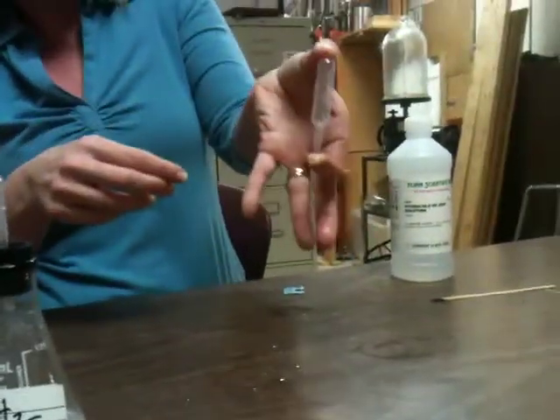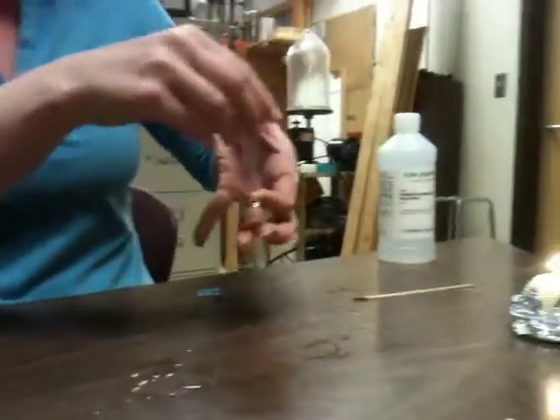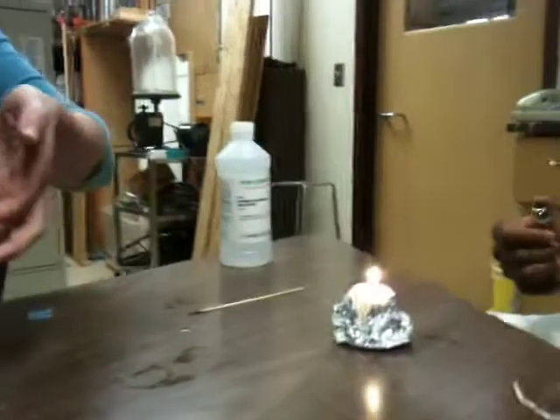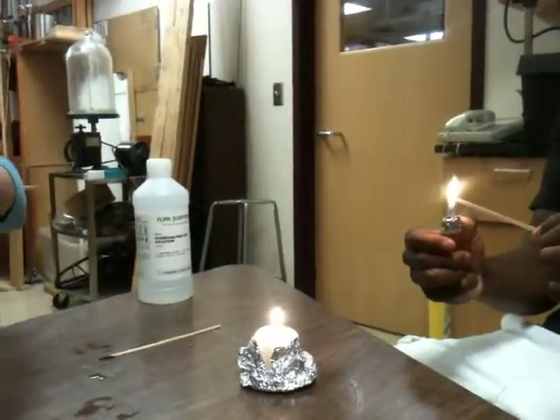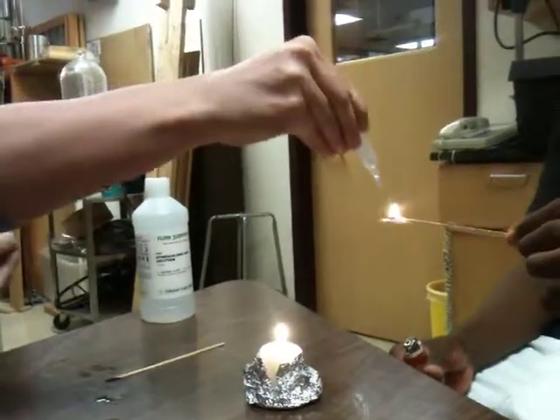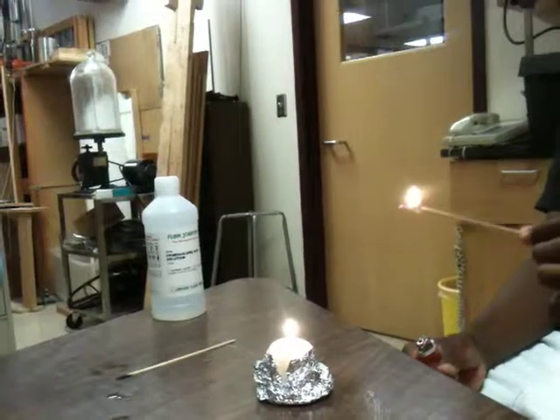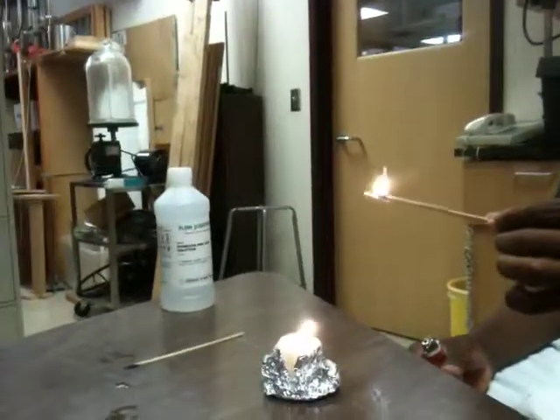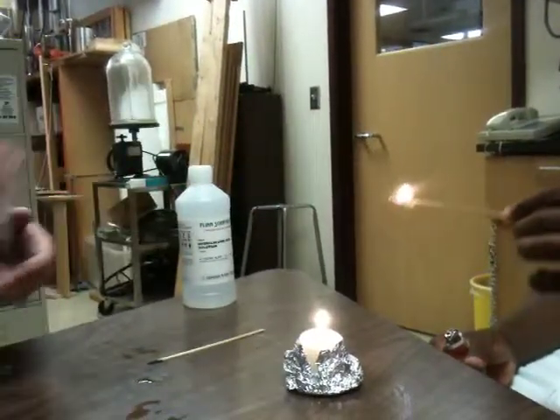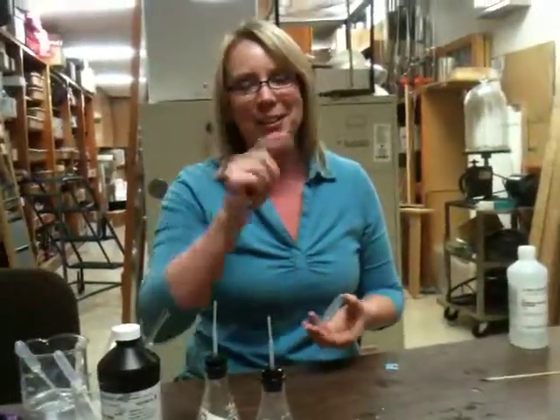And so now that I'm ready to test this, I'm going to have Harold go ahead and light a splint. He can light it with the candle or the lighter, and I'm going to squeeze this. Okay, now that didn't work, but when you point at that, it should give you a pop test, and you should be able to rank the noise, or the sound level, on a scale of 1 to 10. Okay, pause that.